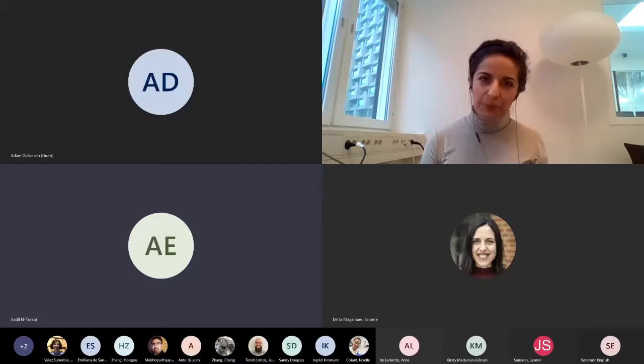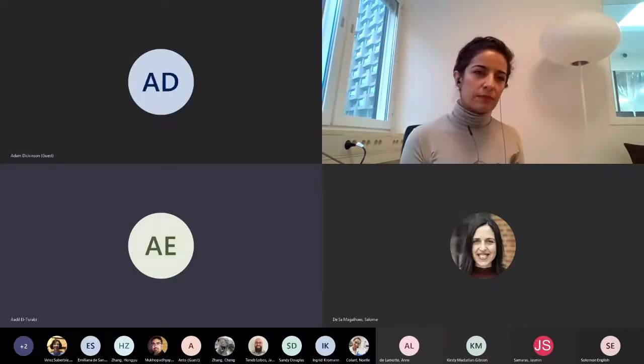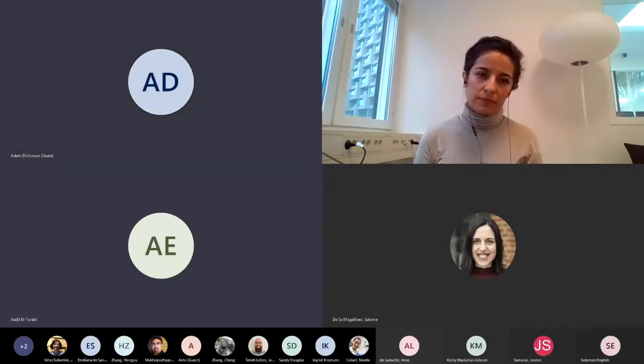My other question was, we have already done EM, let's say, and you've got images. Can we use our raw TIFF files with the Vironova software and your neural networks? Because this would be super cool. I'm looking at particles, but there's also interest in other amorphous fibrillar type of stuff, which could be interesting.